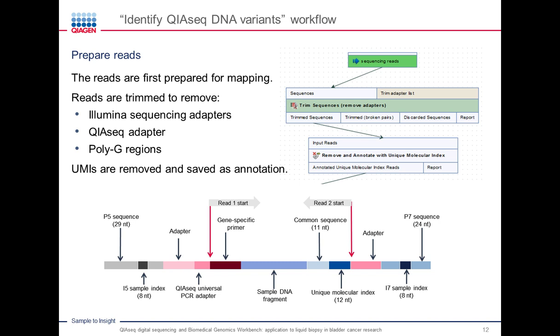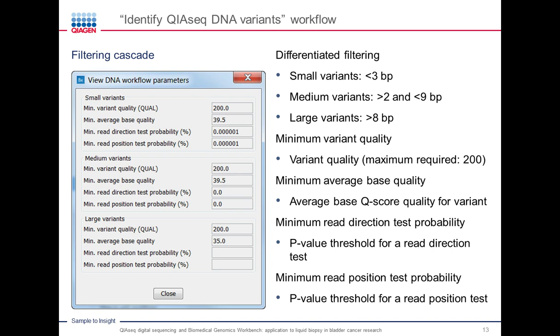The trimming in this workflow is so powerful that it is able to detect this read through even of a single nucleotide. So you understand how accurate your analysis becomes when the removal of this unnecessary information is so accurate in the beginning.